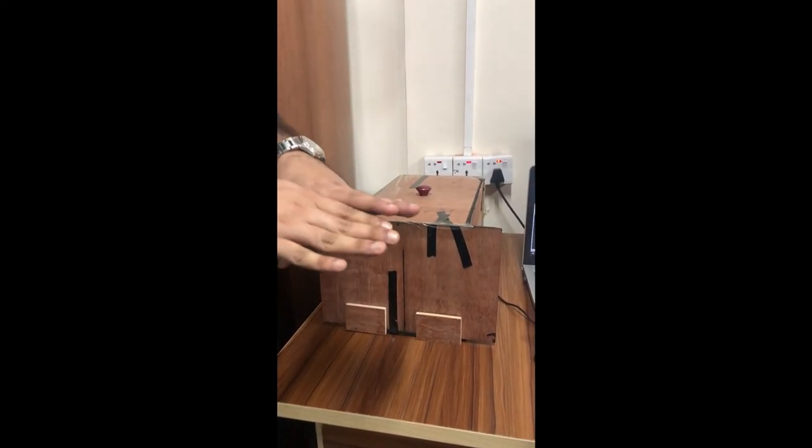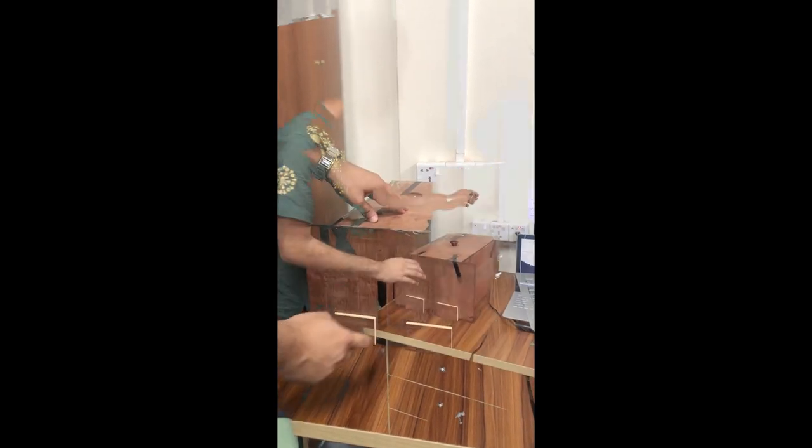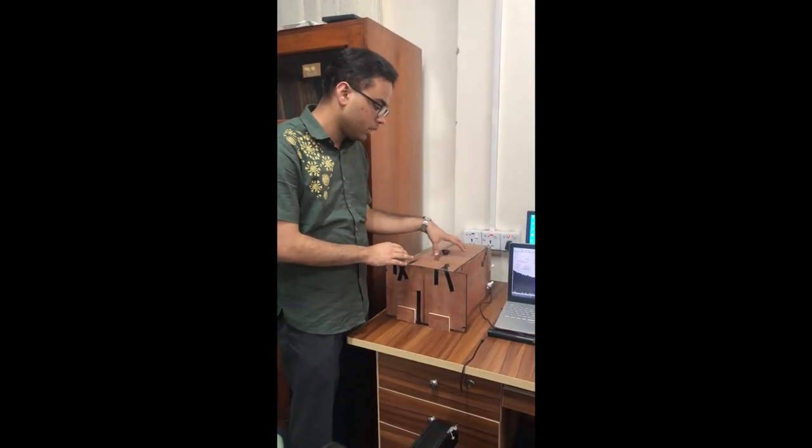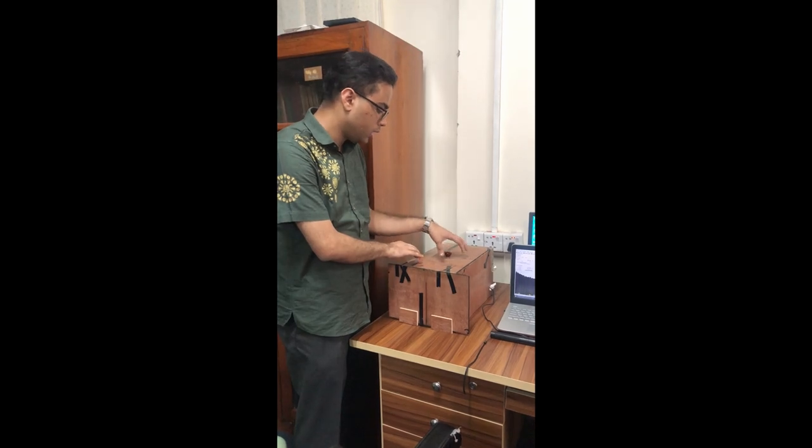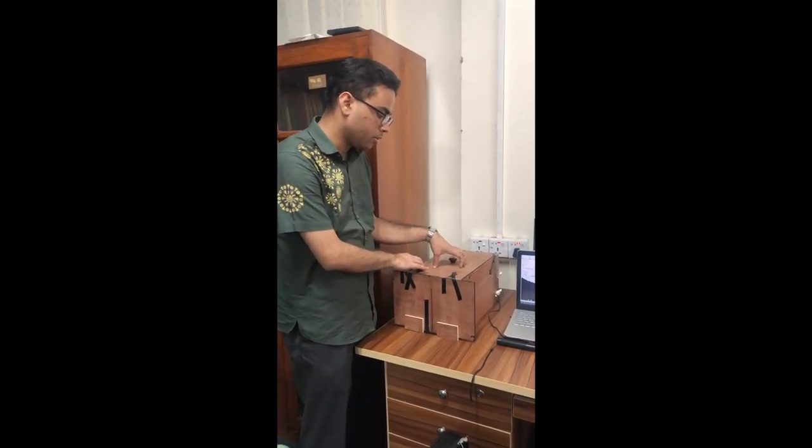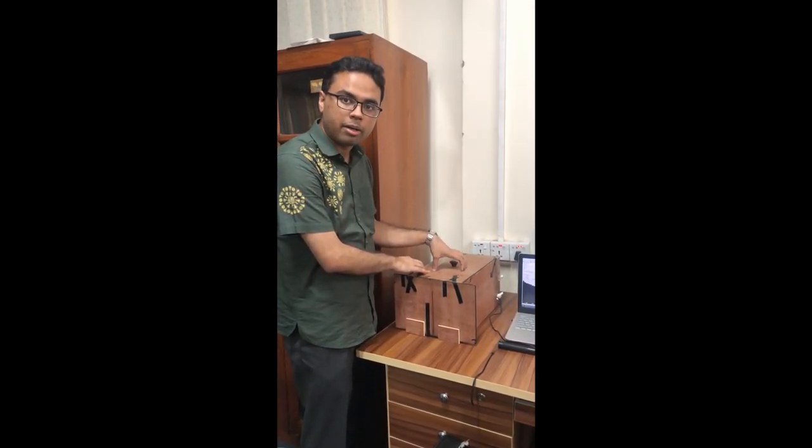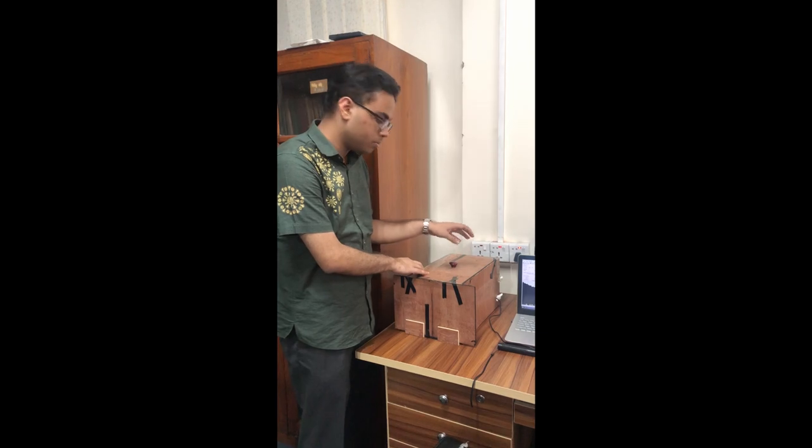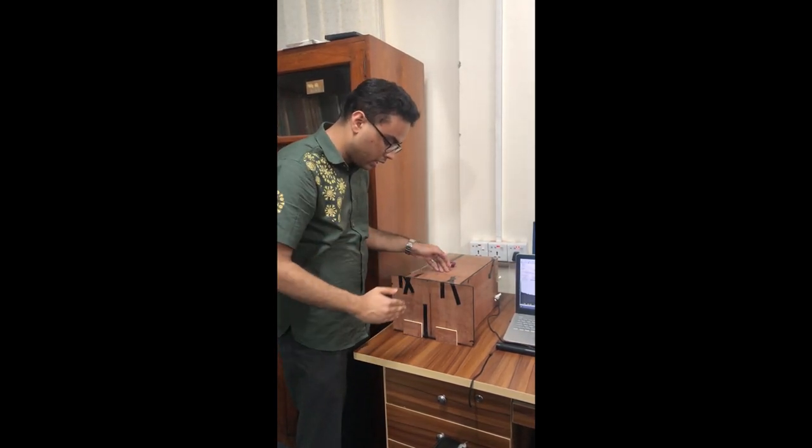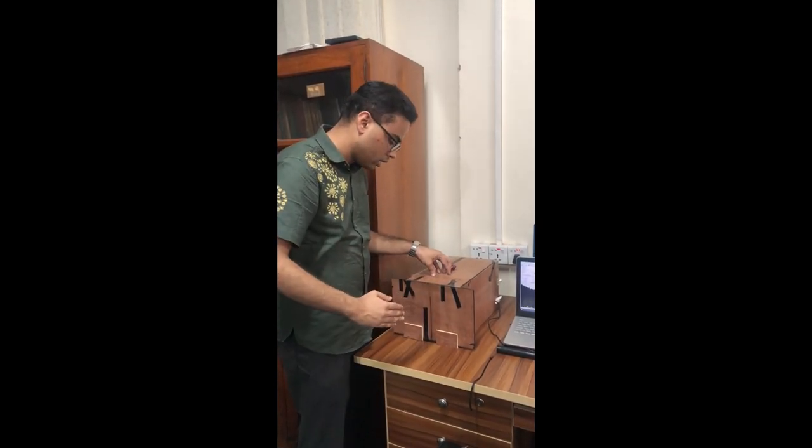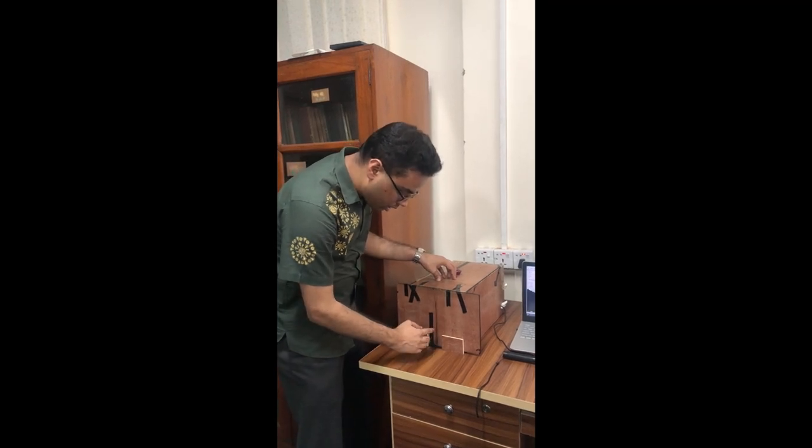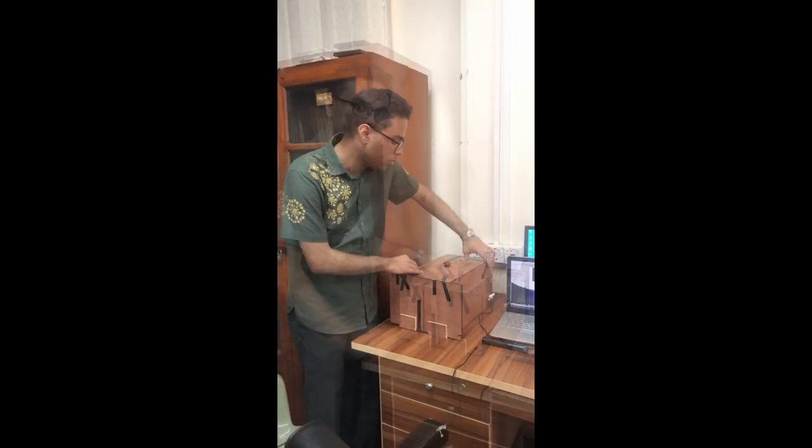It consists of two blades that are shaped just close to each other so that it can create up to one micrometer aperture. Now, there is a camera inside this box.